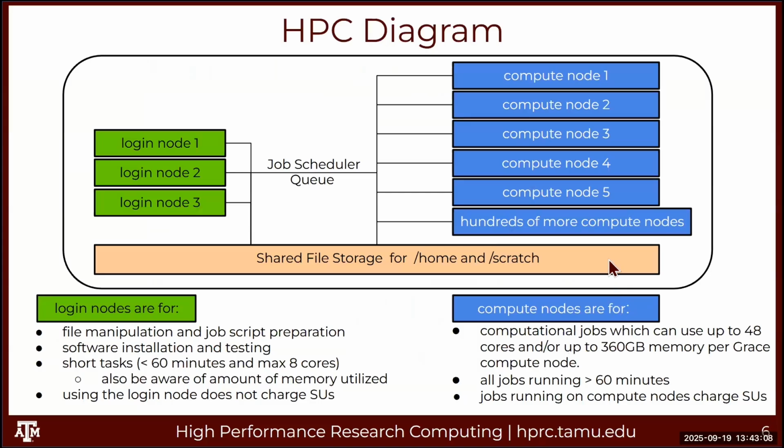Okay, if you're not familiar with HPC, how it's set up, generally we have the login nodes. This is where you do file manipulation, create your text files, upload, download files. You can install software, do some light testing.